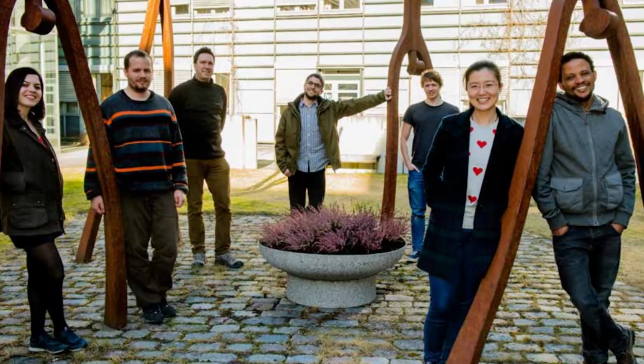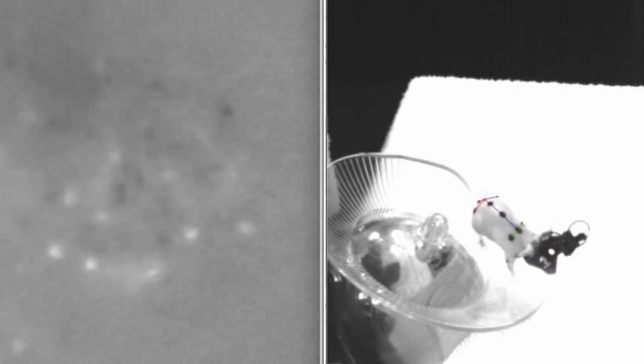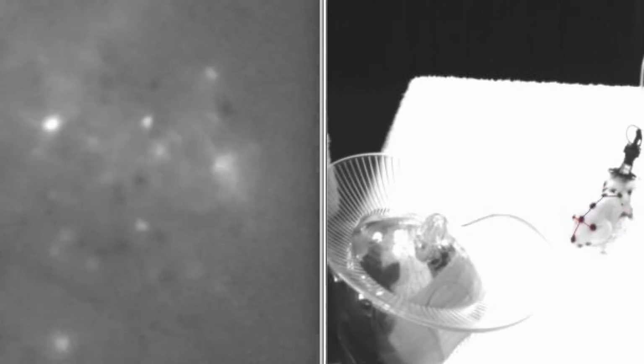My research group began about 3 years ago, and I knew that one of the changes I wanted to make in my line of research was to use calcium imaging in freely moving animals, simply because of the very large number of cells that you can get at a given point in time.